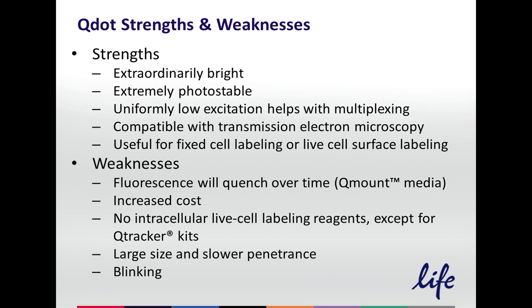One person asked about FRET. QDOT has been used as a FRET donor because they're so extremely bright. There are a few papers out there, but we haven't qualified that here internally.